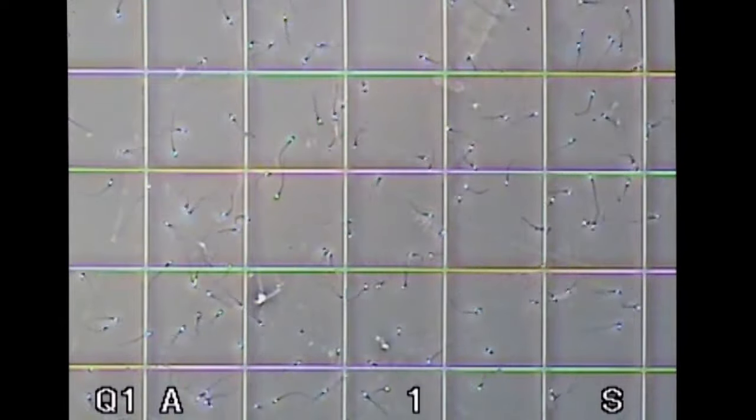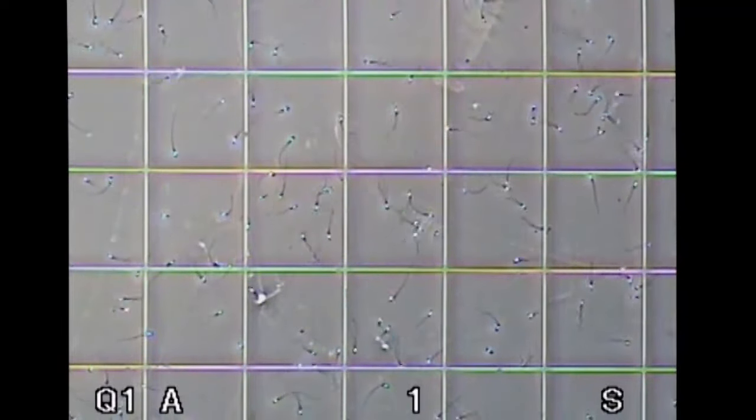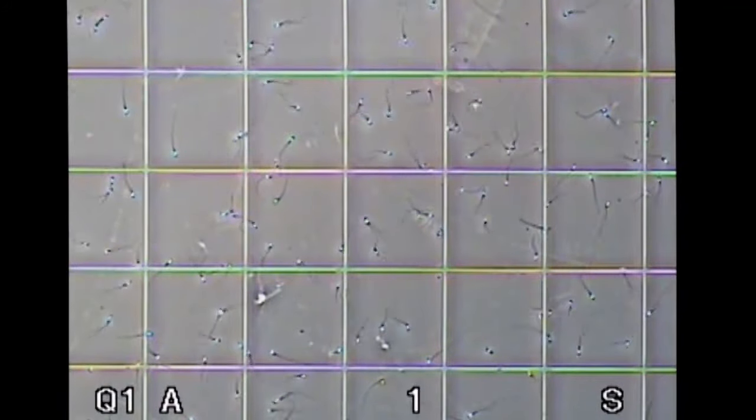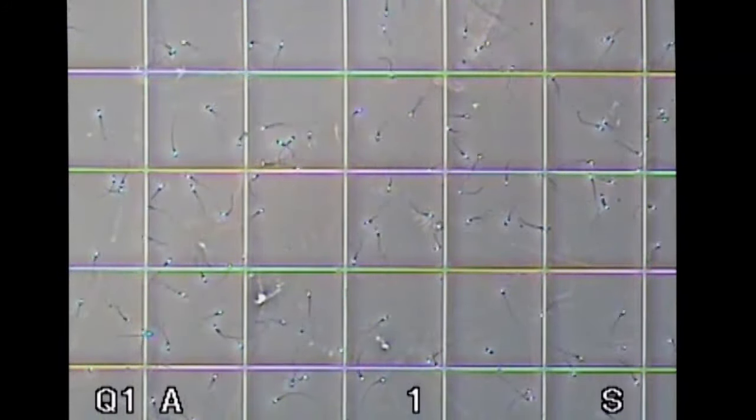In order to determine the sperm count on this type of chamber, we count the number of sperm present in a standard number of squares and use a formula to calculate the sperm concentration.